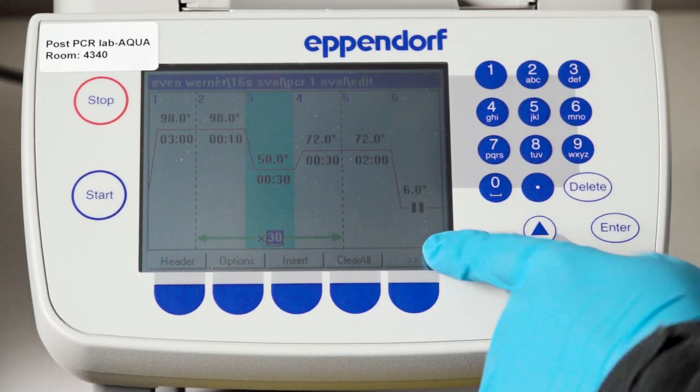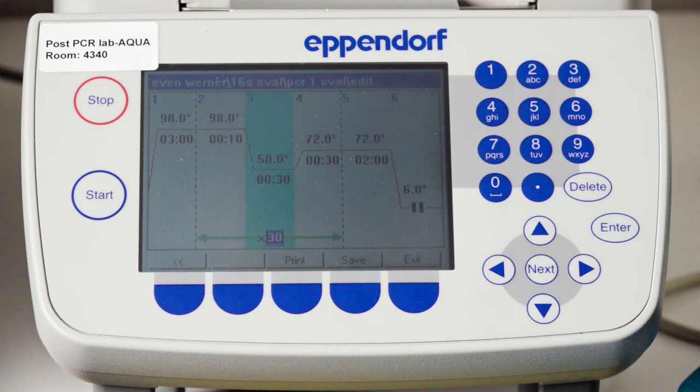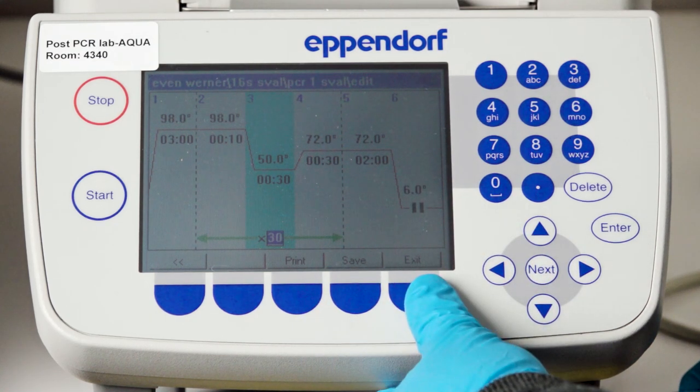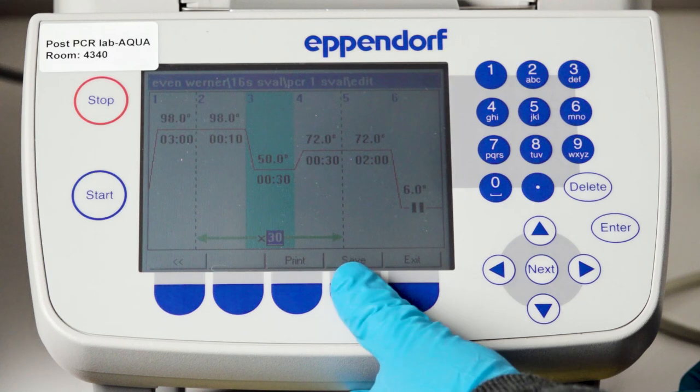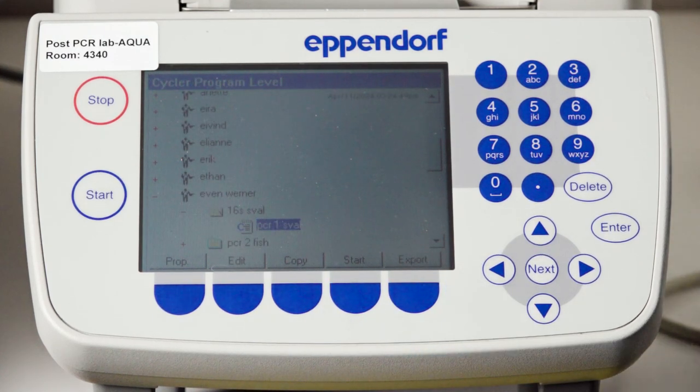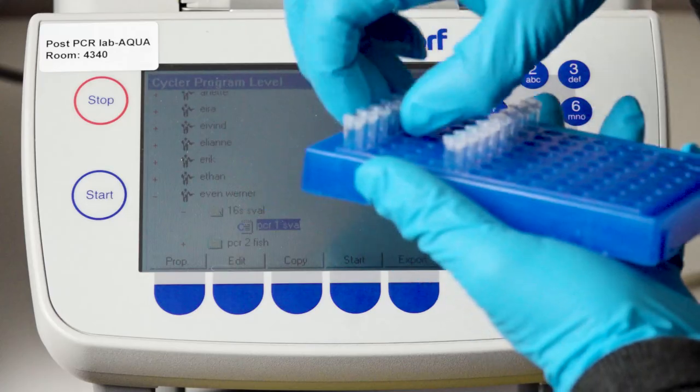This here looks all good for this program and these types of samples. So then I push the button here that corresponds to the two arrows. I haven't changed anything so I just take exit. If you change anything then you need to take save and then exit.